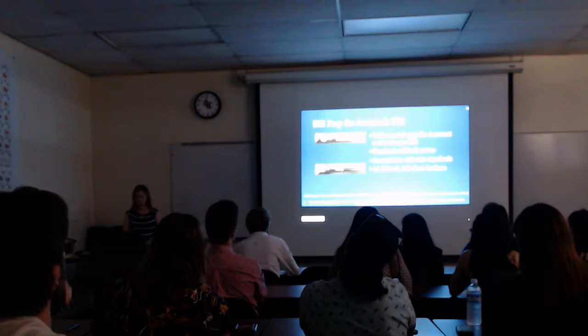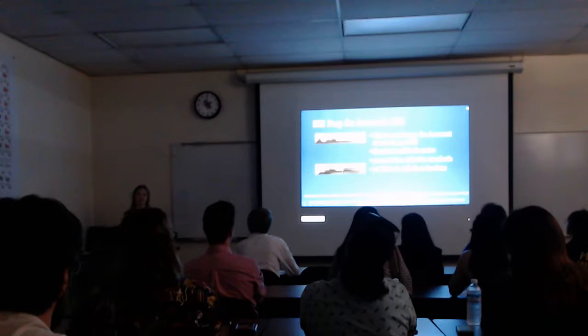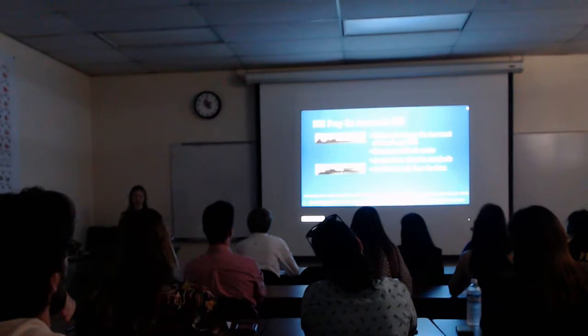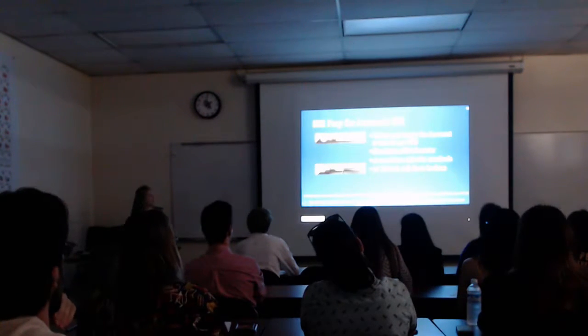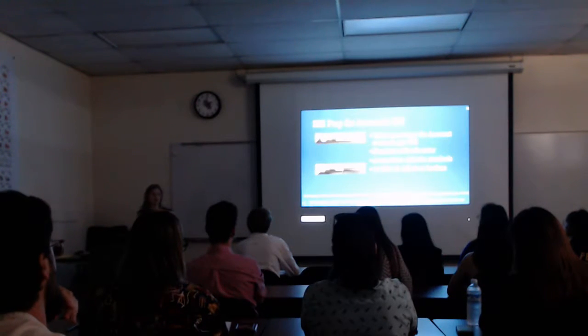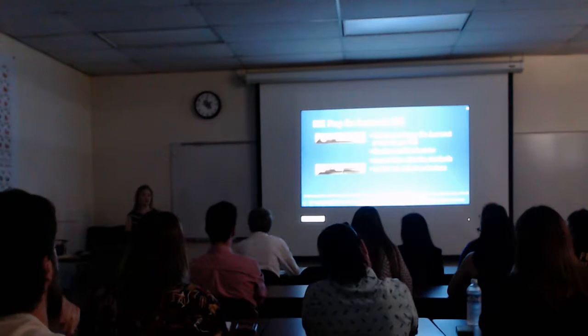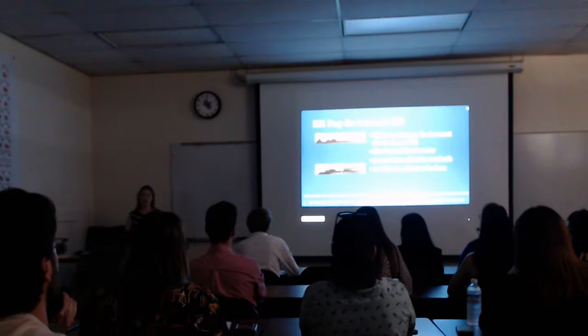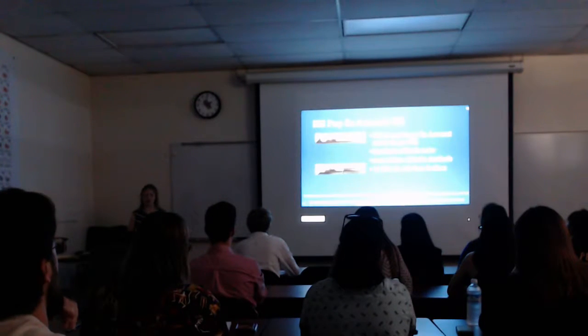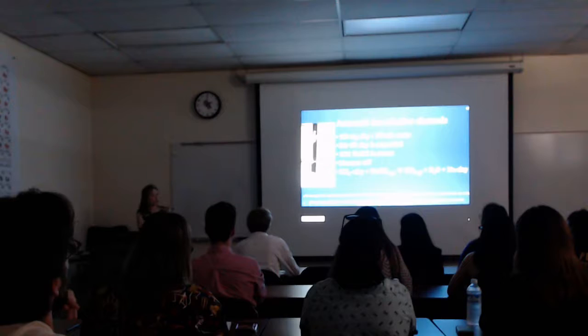So the actual electrode that we used was an Acumet ammonia gas ISE. This was connected to a standard millivoltmeter and then standardized. Unfortunately, this membrane that we have is Teflon, and it's very easily damaged by either touching it or if it comes into contact with the stir bar during reaction. This is why we have to use 200 milliliter tall form beakers in particular, because the stir bar is already very close to the membrane, even in this kind of beaker.